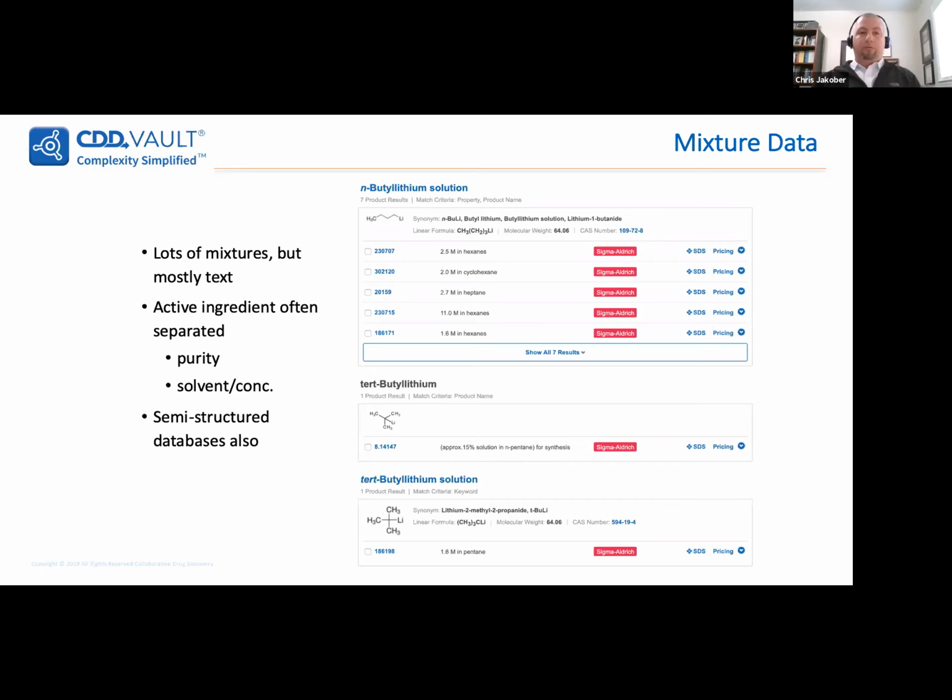Yeah, I could see a huge value for your synthetic laboratories in higher education, being able to accurately describe the composition of something as opposed to just some combination of syntax of the synthetic chemist's initials and the notebook number and the page number, such that somebody down the line knows exactly what that material is when it comes time to, say, clean out a lab or dispose of materials. Knowing what the composition of that material is and reducing the number of unknowns can significantly reduce the cost of trying to dispose of materials when labs turn over in higher ed.